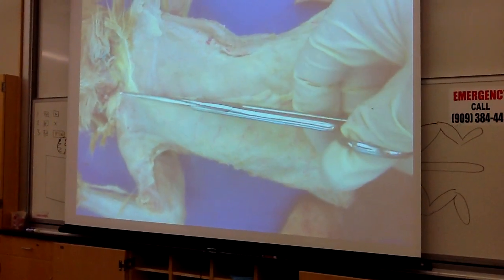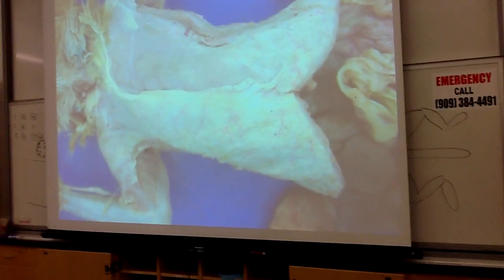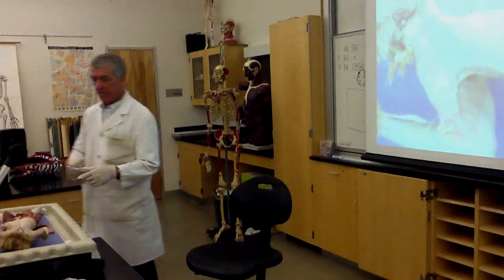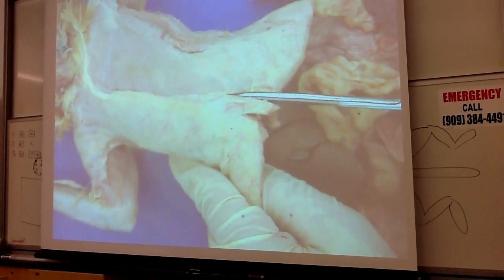I'm not going to cut up the center because there's a bone there. It'll be really rough on my scissors. But if you know a rib cage, between your ribs and your sternum, there are little pieces of cartilage here. So it's not so tough to cut right here, just beside the cat's sternum. Okay? So I'm going to make one cut like this.